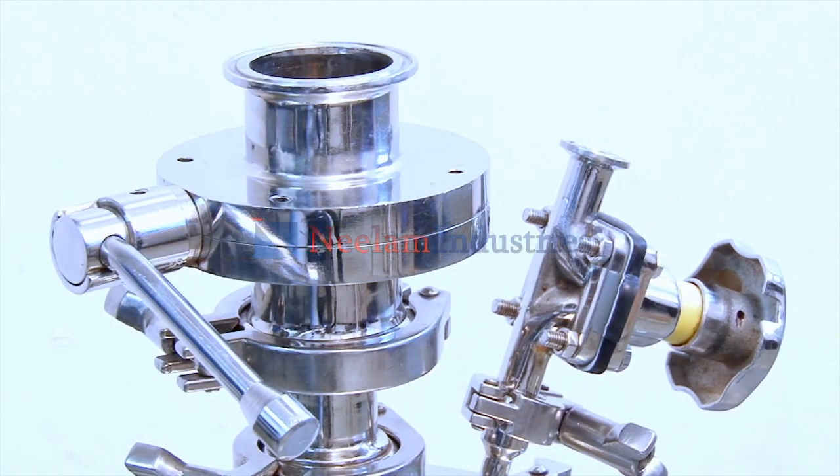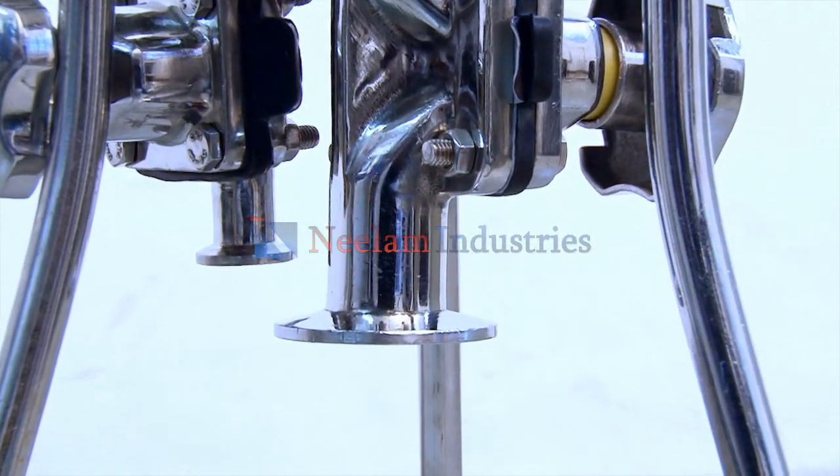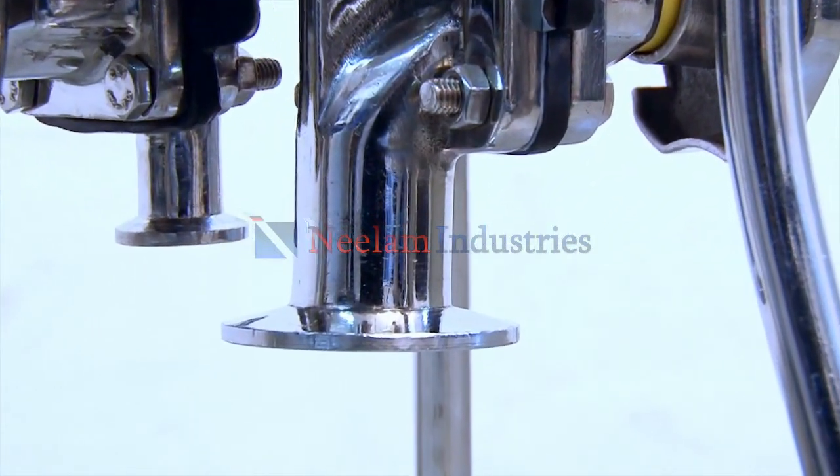The inlet and outlet connections are of sanitary design for easy cleaning and maintenance of the membrane filter holder.